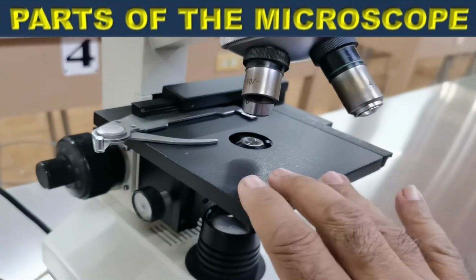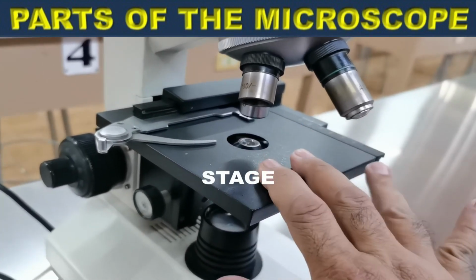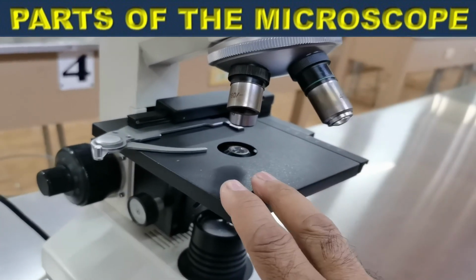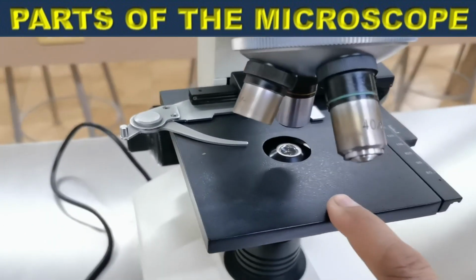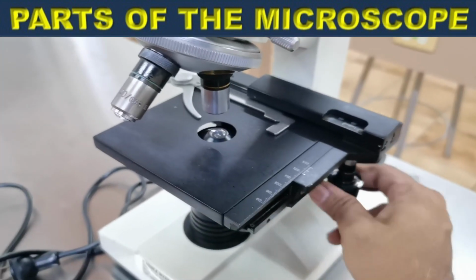Then we have here the stage. Now the stage is where you place the specimen. Usually the specimen is mounted on a glass slide. Then you place the glass slide here. So this is the stage clip. And you can adjust the slide using these knobs.